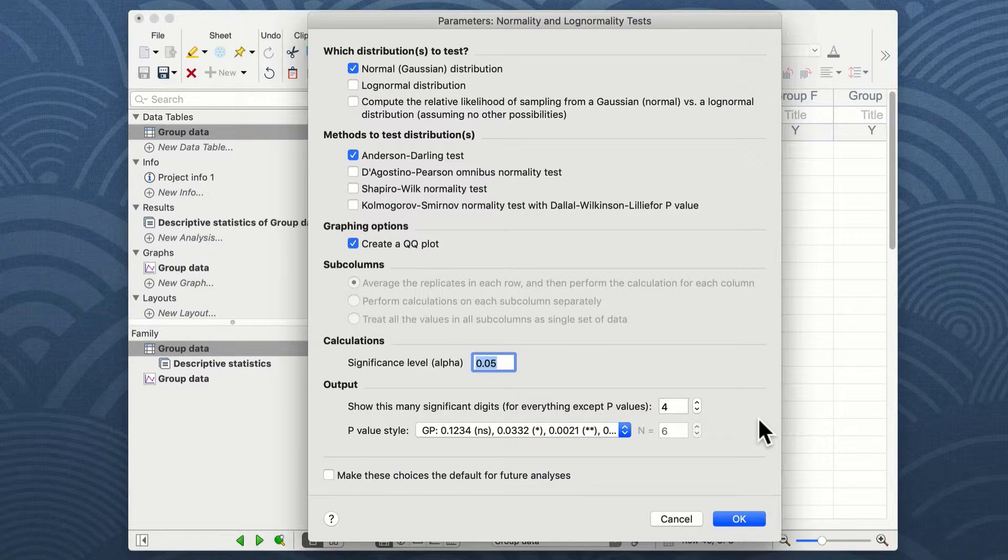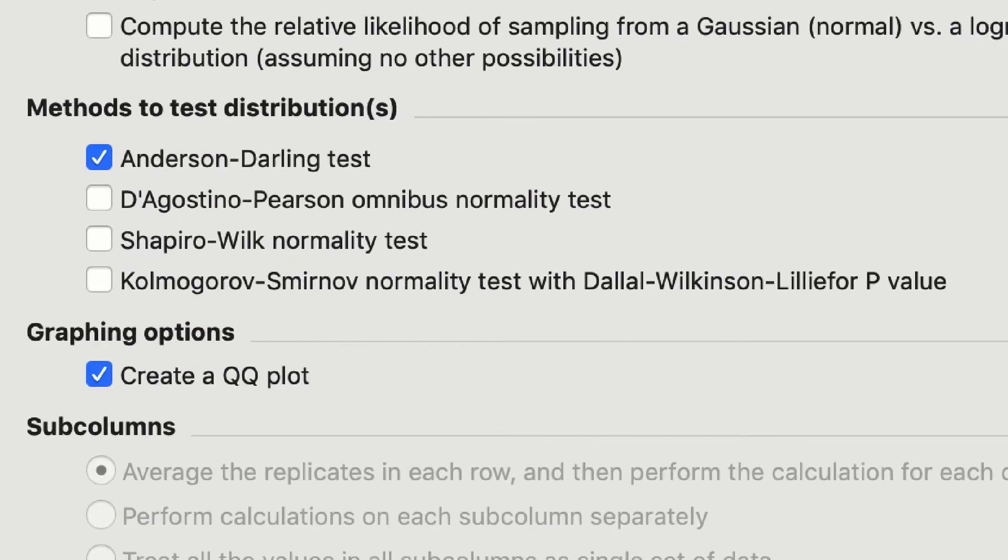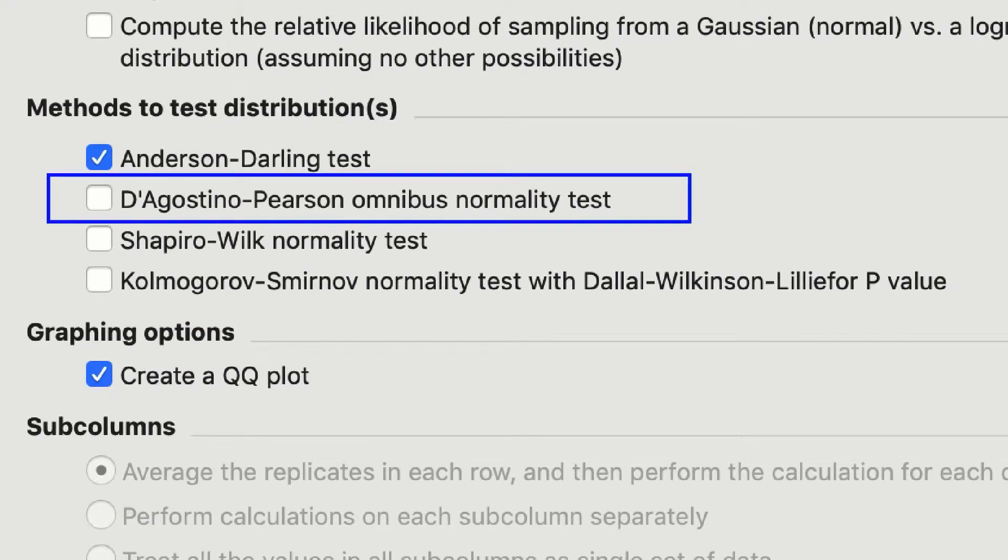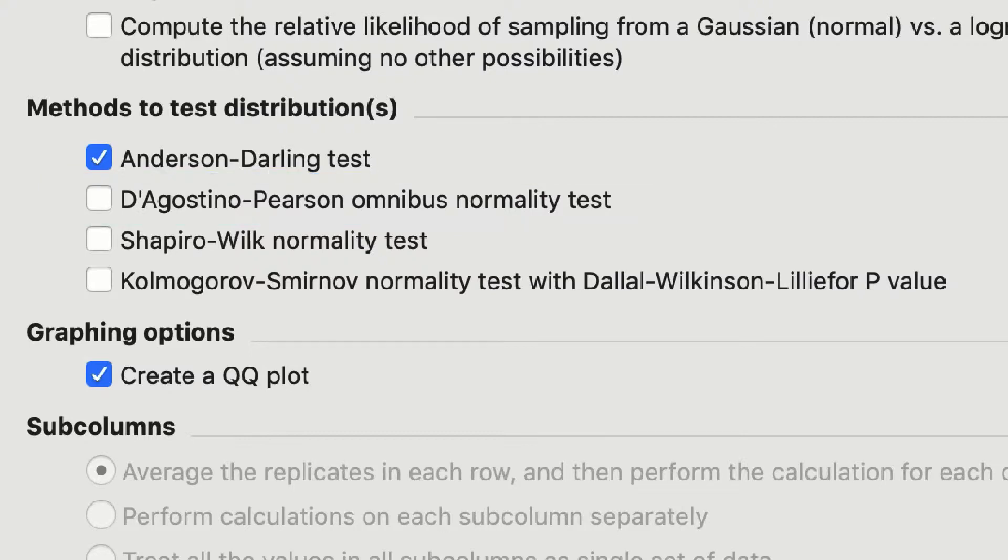There are a number of options in Prism of which method you wish to test your distributions. We actually recommend the D'Agostino-Pearson normality test. The one that Prism uses is the omnibus K2 test. The test is very simple and works out how far the distribution is from Gaussian in terms of asymmetry and shape, and then it calculates how far each of your values differ from the value expected with a Gaussian distribution. It produces a single p-value from the sum of these discrepancies, which it then reports.